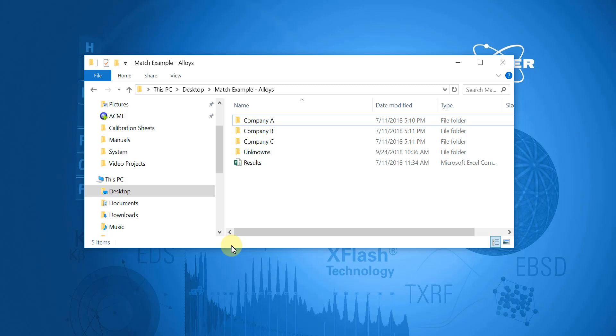So in this example, I will group the data by source and name them company A, B, and C. I will also have a separate folder for all of the unknown samples.